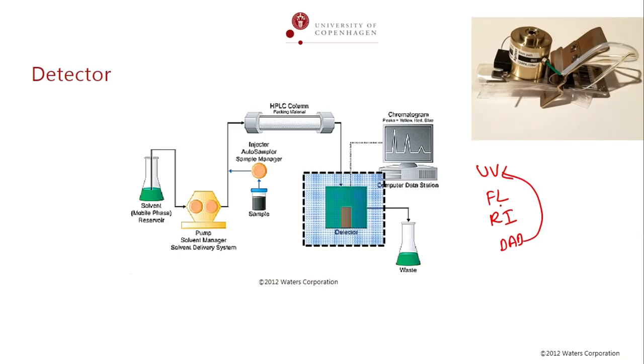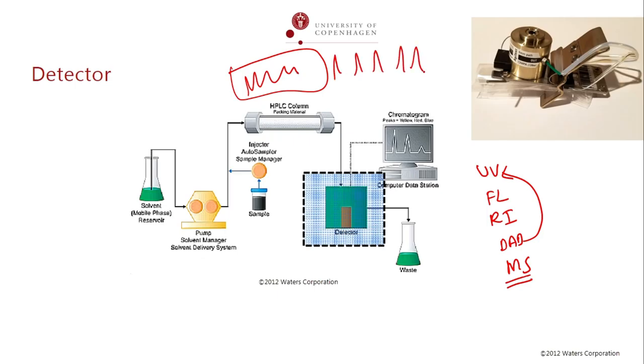Fluorescence detector I covered. It can be detected to the most famous MS, mass spectrometer, right? So LC is the part where the separation takes place. Separation takes place here, and once the analytes separate, they come one by one, and that will be detected in the detector. Am I clear?